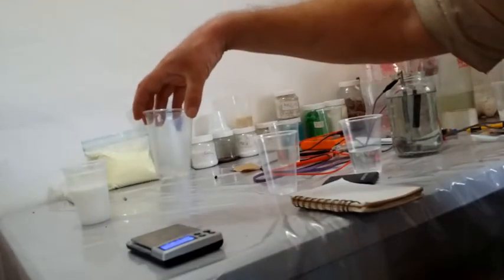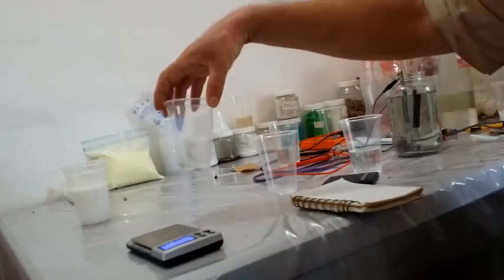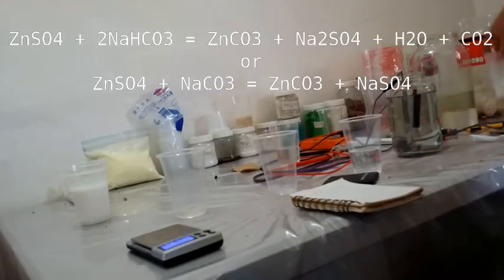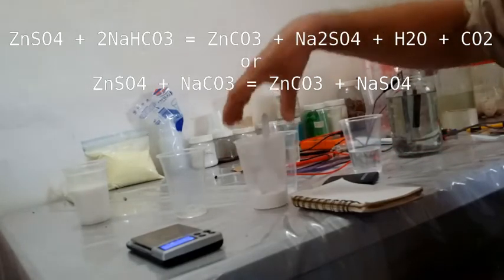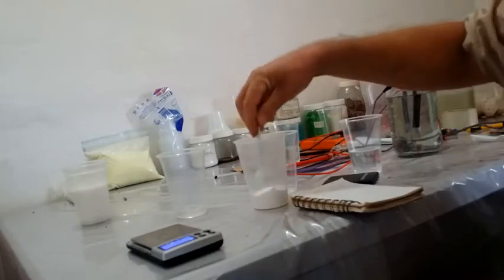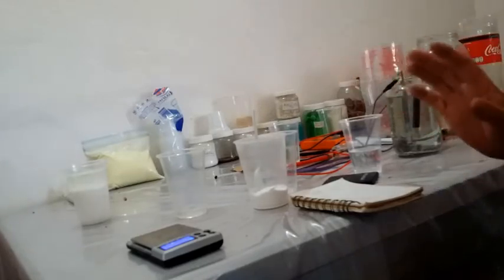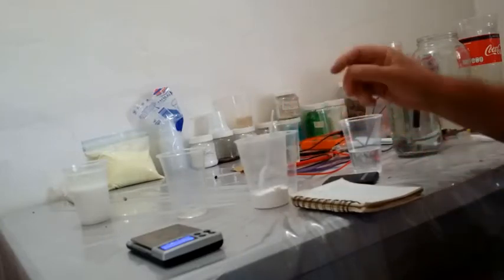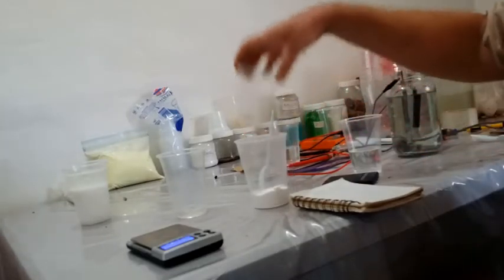To make zinc carbonate, I need either an equimolar amount of sodium carbonate or a double molar amount of sodium bicarbonate. I prefer sodium bicarbonate for this because sodium carbonate produces a gel, whereas this produces a nice powdery sediment. It costs a little bit more, but I'm going to go with this one.